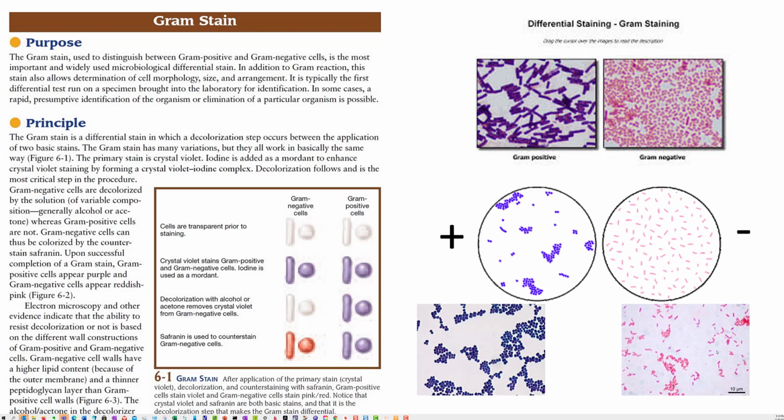So here are nice grape-like clusters, which will be your staph, which is nice. And here you'll see a blunt rod, gram negative, and it looks like E. coli. This is the inspector's first clue as to what the causative agent might be, and then we start to think about tests that might confirm our initial suspicion. So the idea is to get you enough information using your microscope and the gram stain. Having the gram stain information is enough to start antibiotic treatment, because we can use broad spectrum antibiotics for gram positive, gram negative. So that information alone is very useful.